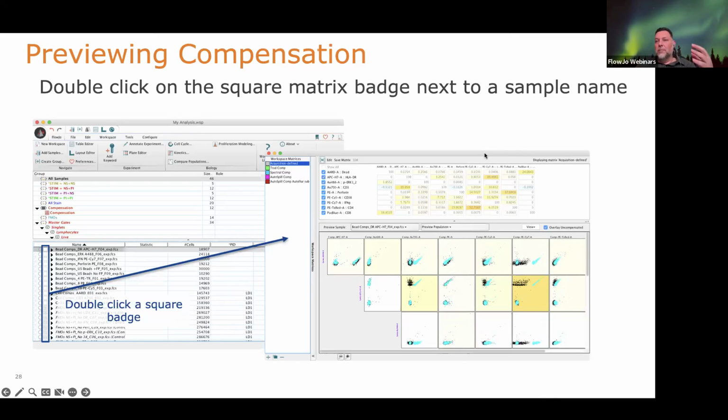It's gotten much more complicated with the expansion of detectors, the advent of full spectrum cytometry, and the number of probes that we can use in an experiment have gone so high that we want to look at everything, but maybe it won't be perfect in that one experiment. You might have to break it down. Certainly different tissues, I might consider doing unique compensation controls because the autofluorescent properties of my splenocytes are different from microglia in the brain. And so consider that.